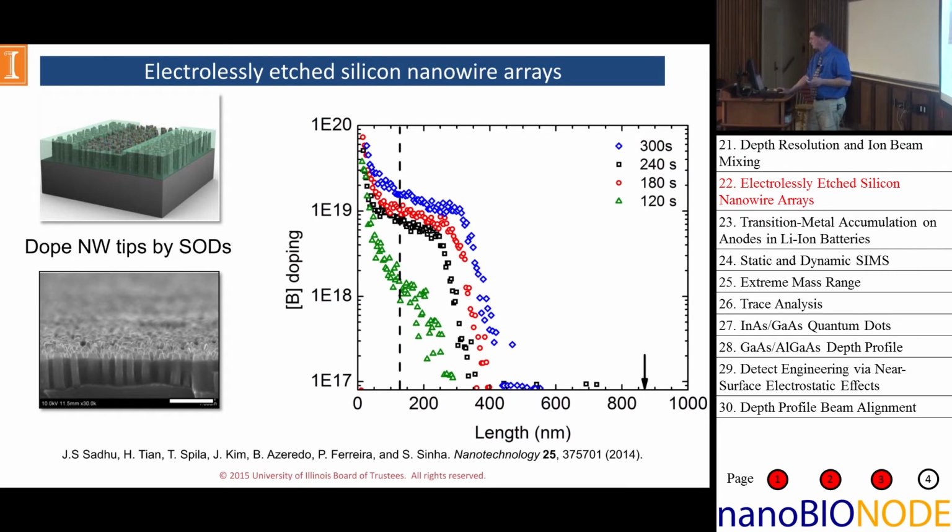This is more recent work. The problem they had is they wanted a non-lithographic patterning of wafer scale nanostructure arrays. So they've got all these little guys sticking up, and they want to have those well doped. The problem is if you dope them before etching the arrays, you end up with very porous structures and it doesn't work well. So what they attempted to do here was to make the arrays and then dope it after the fact using a spin-on dopant.